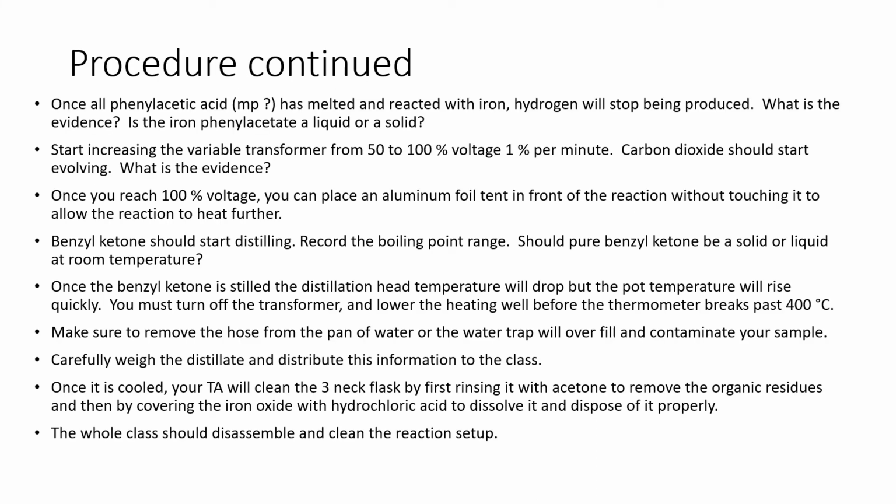So after the first reaction of the acid with a metal, we say that the hydrogen will stop because the hydrogen is formed normally between the radical of the acid and another hydrogen normally from the environment. So how do you think we know that the hydrogen stops? Remember that you're using water displacement to trap hydrogen. So with that, how do you think you'll be able to know that hydrogen is no more produced?